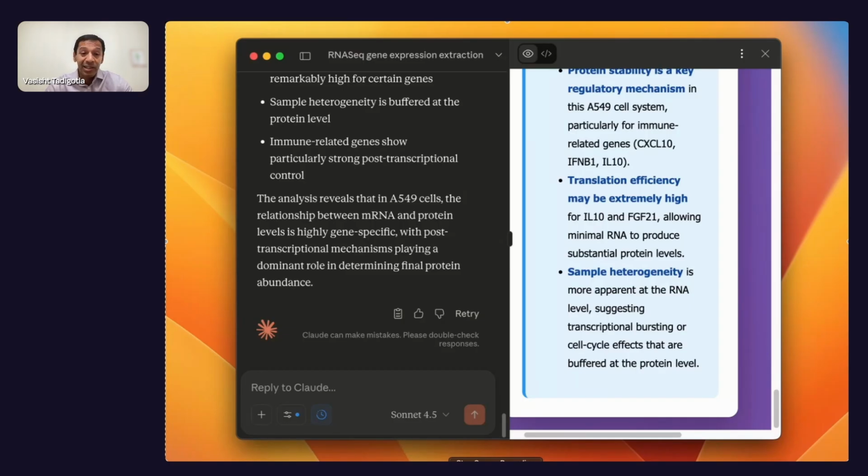So again, this is an initial analysis. I'm sure we can do deeper sets of analysis either by asking Claude to query or chat about the findings, or take this analysis to a computational biologist or bioinformatician to further dig into why and where and what sort of questions should be asked. So at a broad level, this helps speed up experimentation in our specific use case.